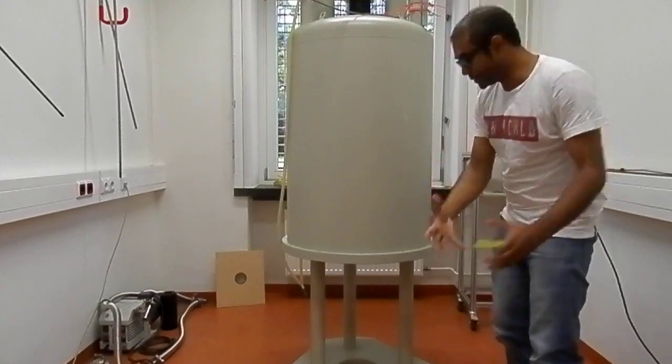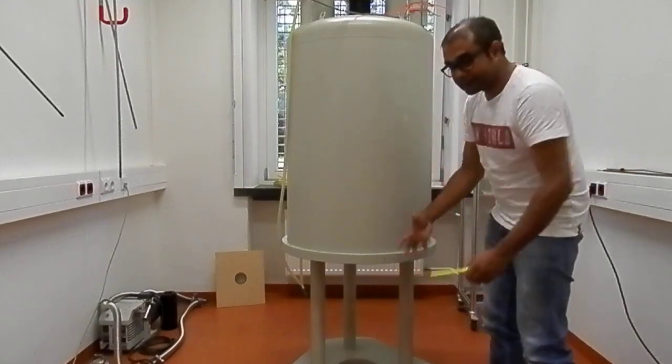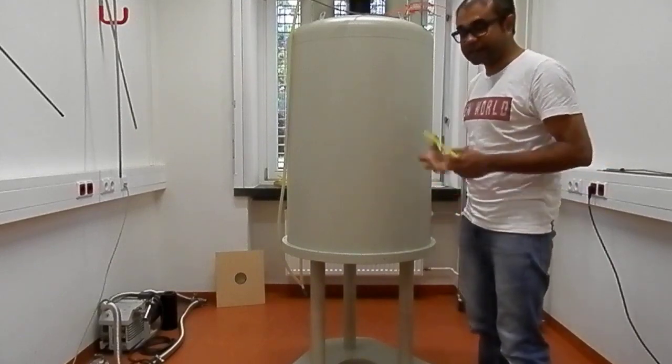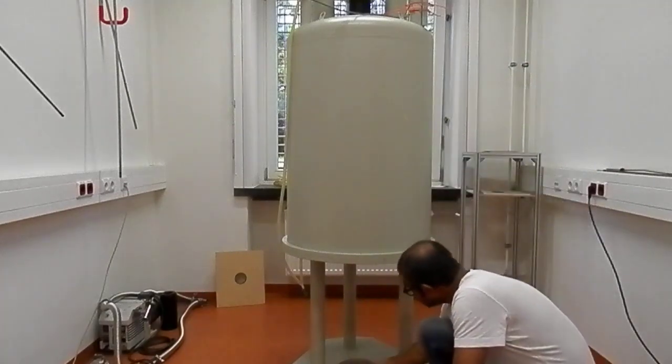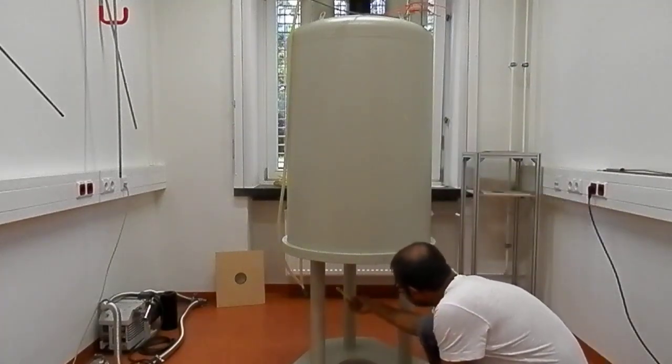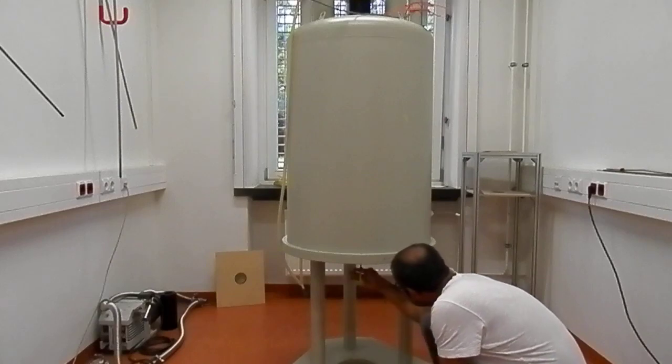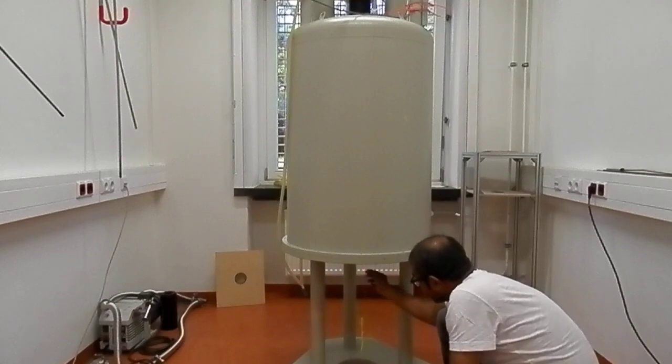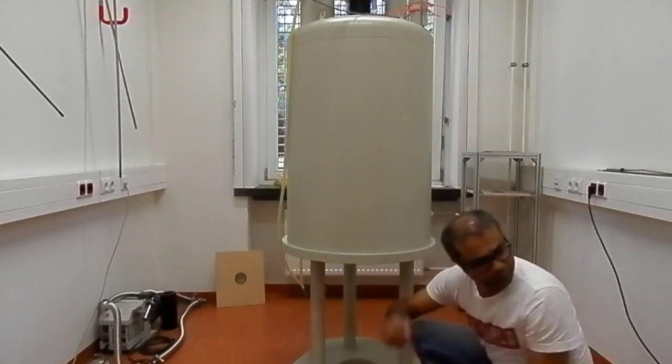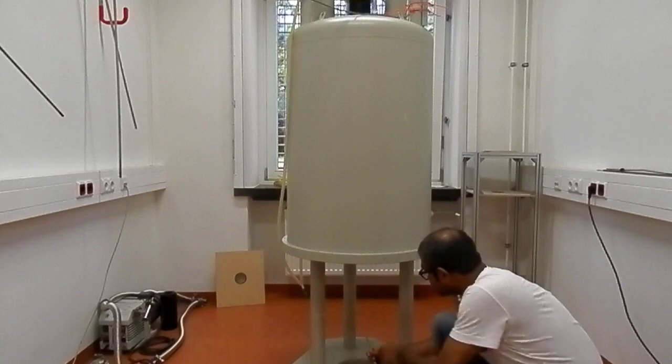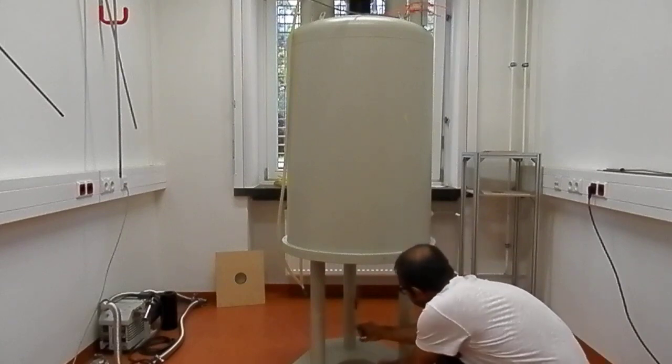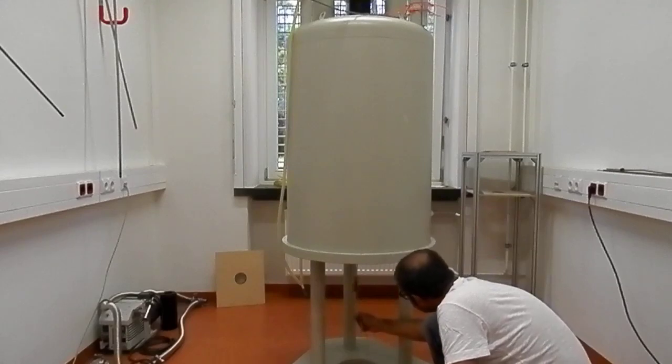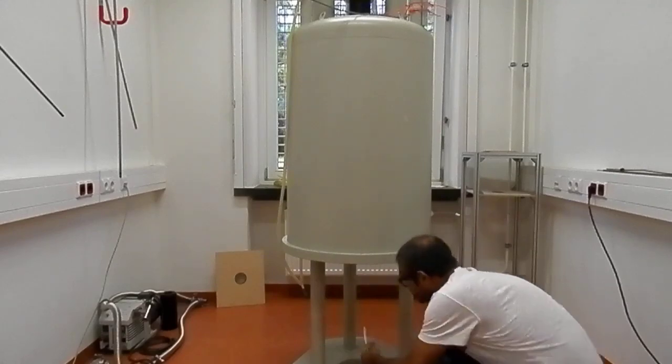It will immediately attract and take these things to the heart of the magnet, and then you cannot take them out. Again, I will show you—if I press this plastic, nothing is happening. If I put this straight like this, it's falling with gravity. Now the same thing with the screwdriver—you see, immediately it's attracted very strongly.